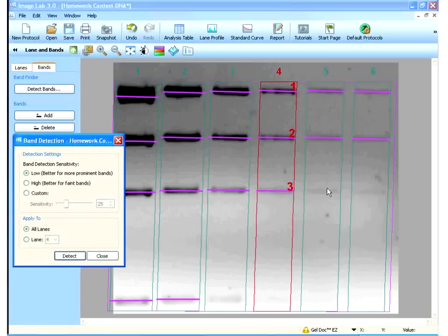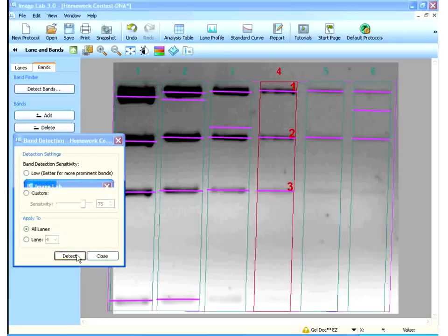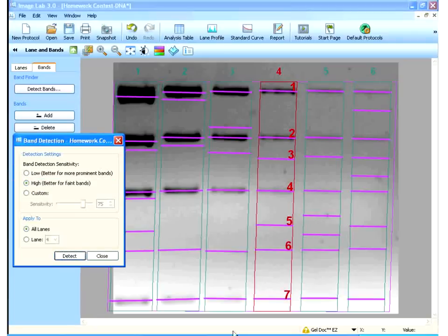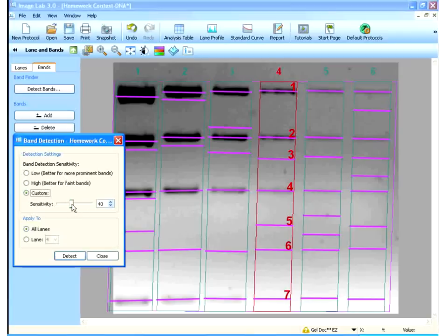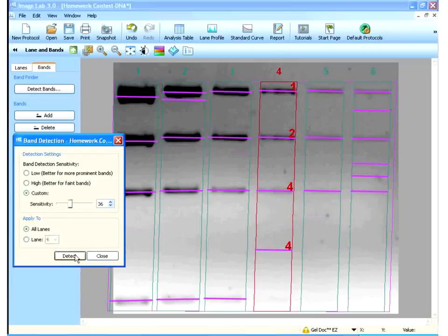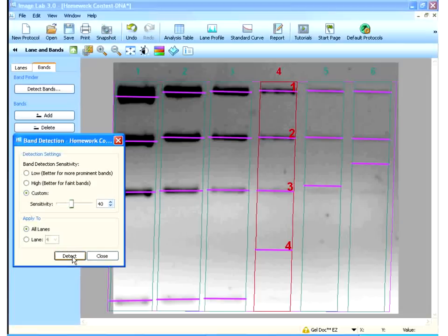I've detected a lot of bands, but I'm missing the fainter ones. So, let's try high. So, I've detected a lot of other ones but a lot of artifactual bands as well. So, maybe what I'm going to do is go for custom and set it to, let's say, between 25 and 75. So, let's try, I don't know, 36. So, not bad. Let's try 40, maybe.